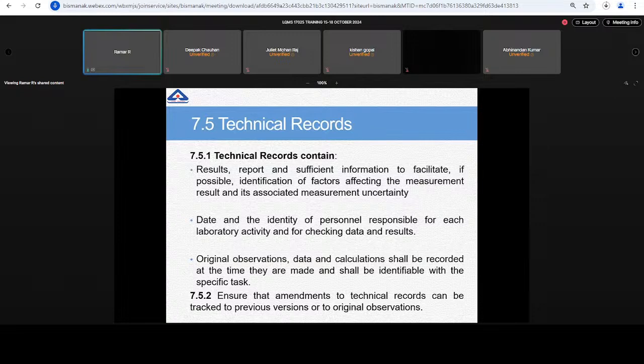They also have to record all the information required for calculating the uncertainty, or for when a sample is retested, maybe as per your doubt, your supervisor's doubt, or your customer's doubt. For any reason, if you are retesting the item, the retesting must be carried out under the original conditions.